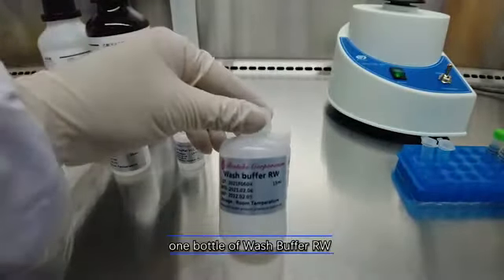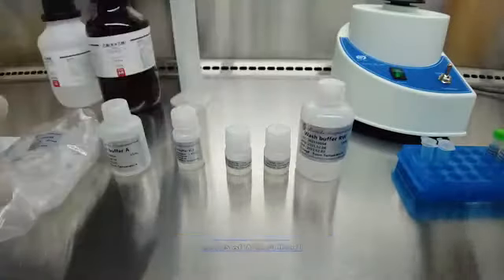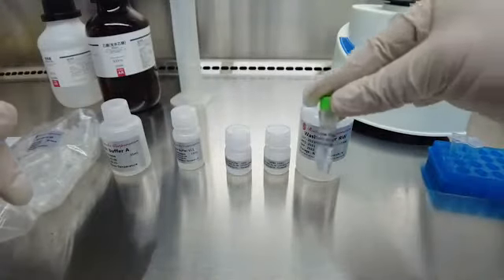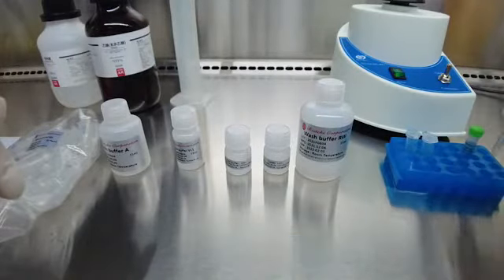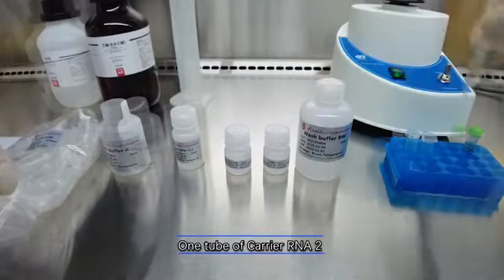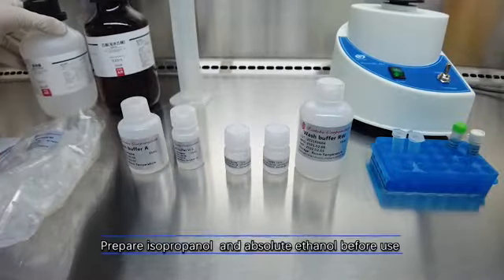The kit also contains bottles of Wash Buffer AW, a tube of Proteinase K, and a tube of Carrier RNA2.